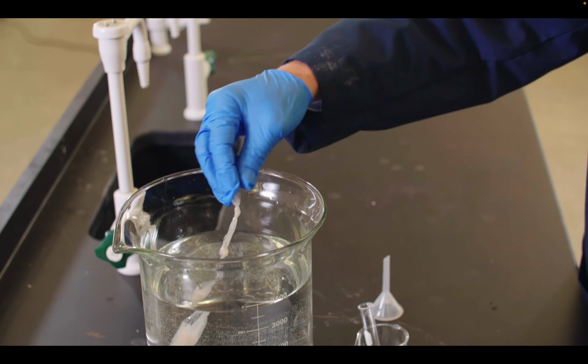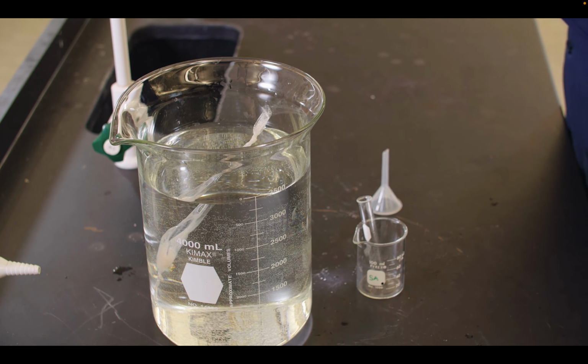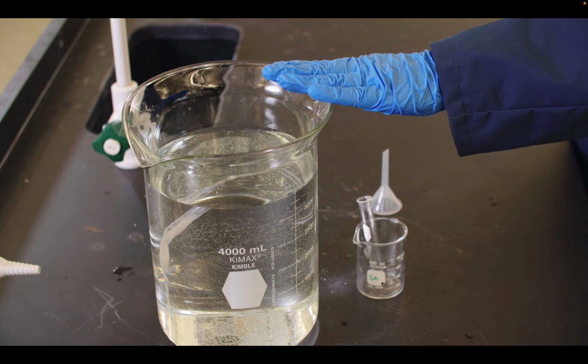And then what we can do is we can just place this in the dialysis solution. And again, this is just more 0.03 sodium acetate buffer, really low concentration, 0.03. So again, there's some there, it keeps some buffering to allow it to maintain a pH, but also not much salt concentration. So the salt will generally want to come out of the dialysis tubing and into this. And because it's such a large volume, we're talking 3.5 liters, the salt will be able to dilute out. All right, so this will need about a day. That'll give us a break at the end of this experiment 6.